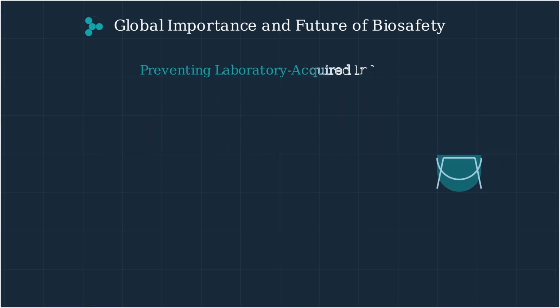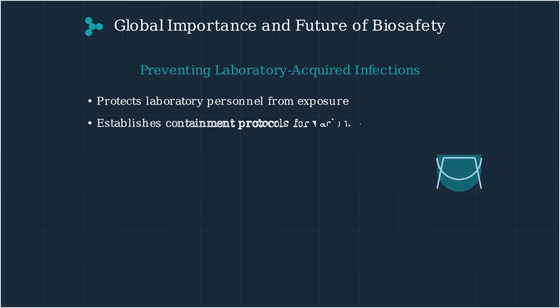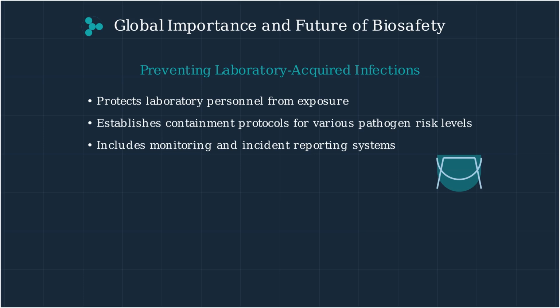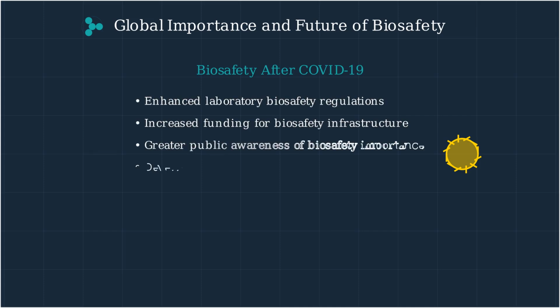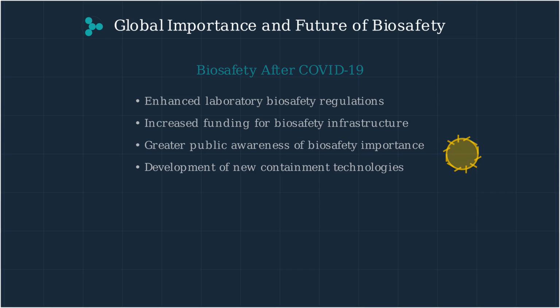Laboratory safety measures are designed to prevent laboratory-acquired infections. This includes personal protection protocols, pathogen containment procedures, and comprehensive incident reporting systems. The COVID-19 pandemic has significantly reshaped biosafety practices globally. We've seen enhanced regulations, increased infrastructure funding, greater public awareness, and development of new containment technologies.